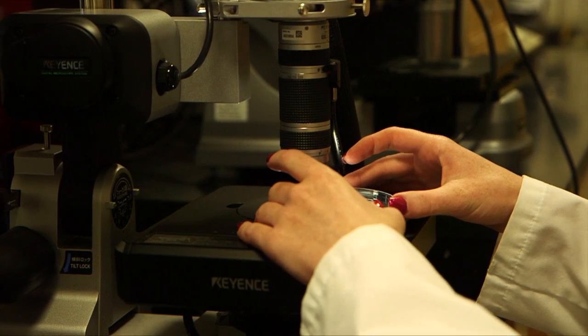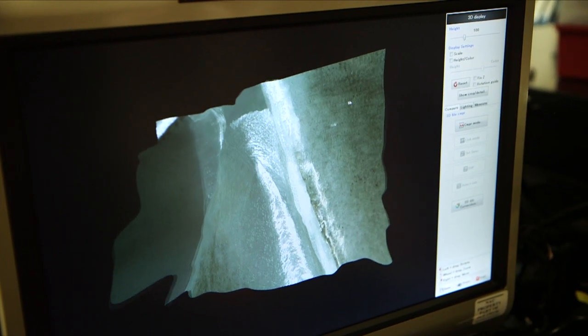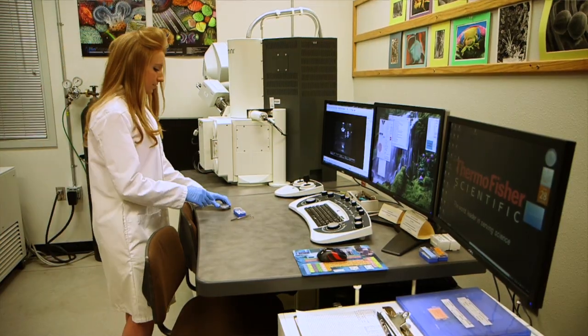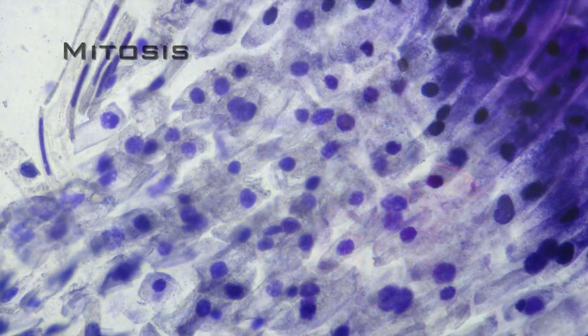We have lots of light microscopes — and now we can see what that particular area looks like — and two different electron microscopes. Both take wonderful images, but it really comes down to what you're trying to image and how small that structure is.